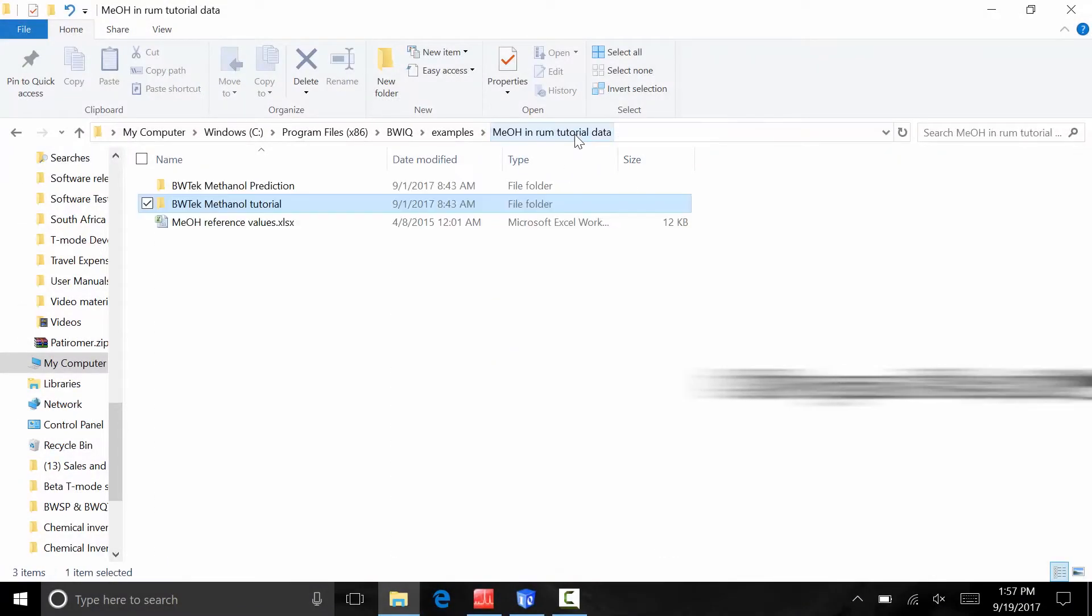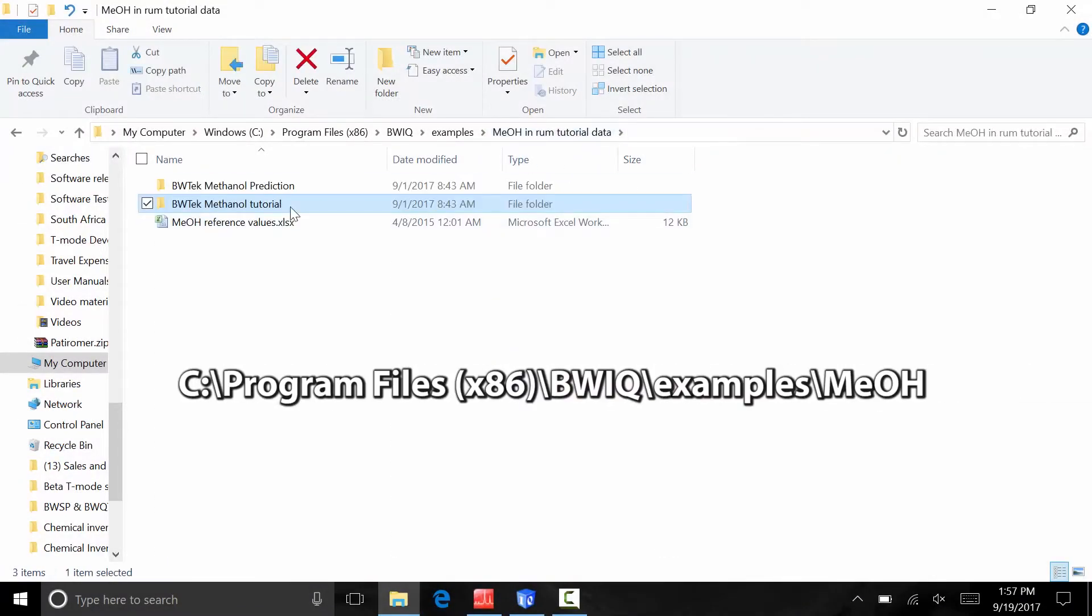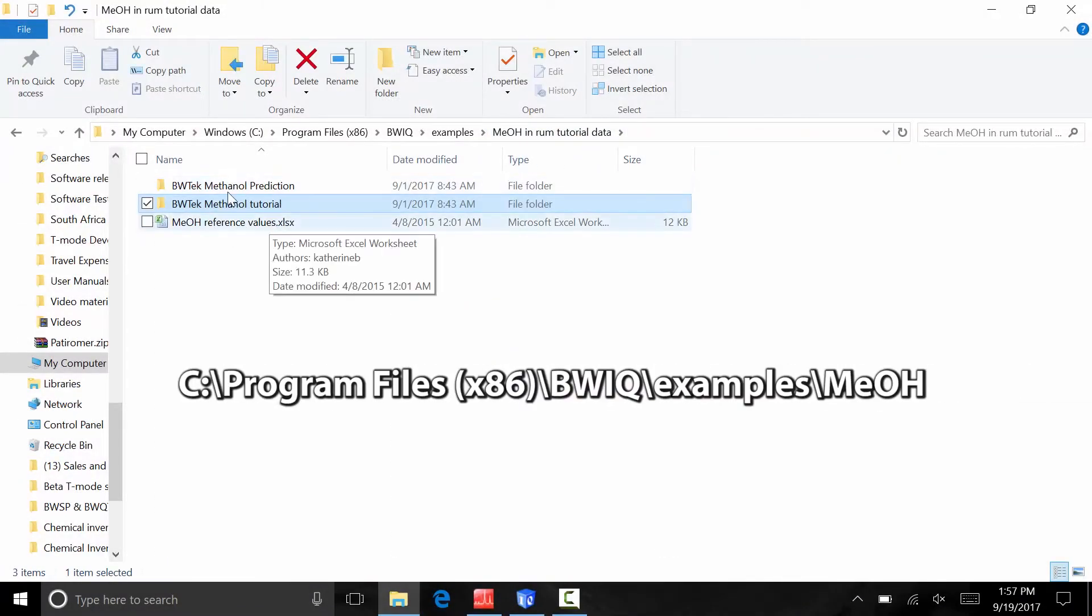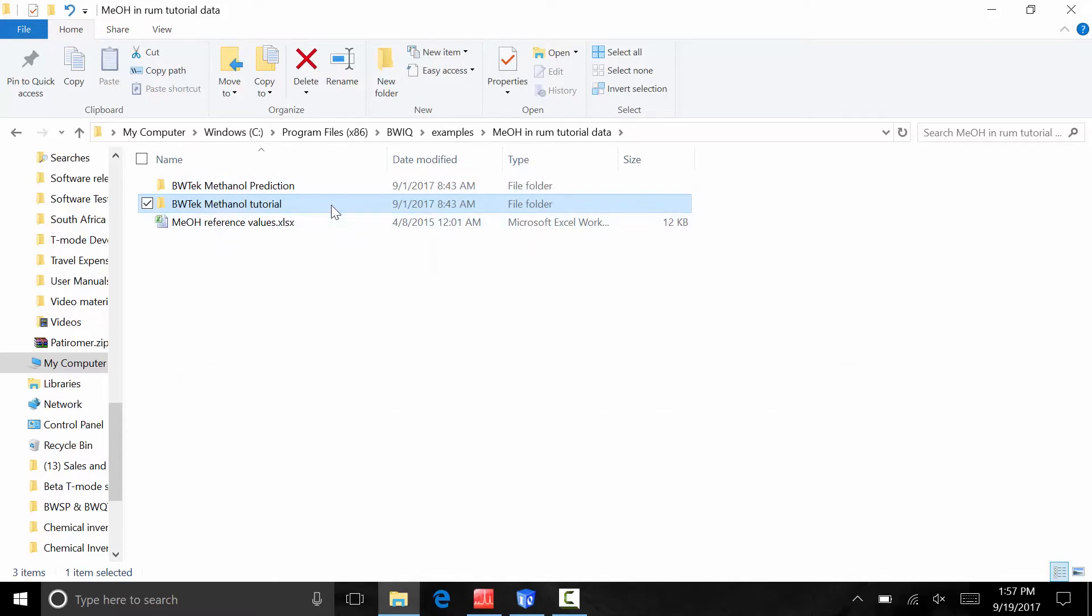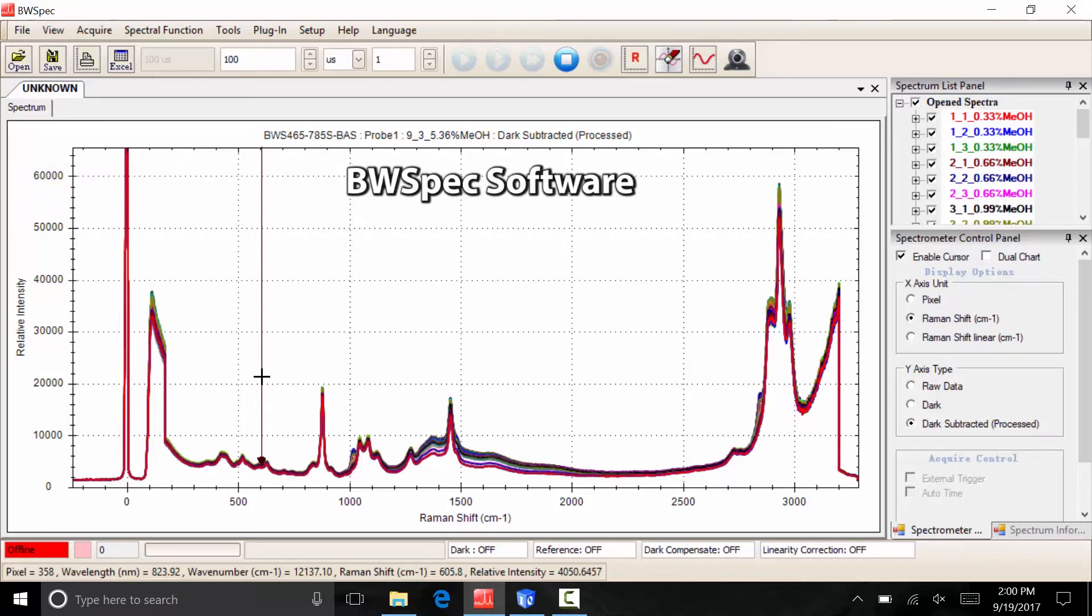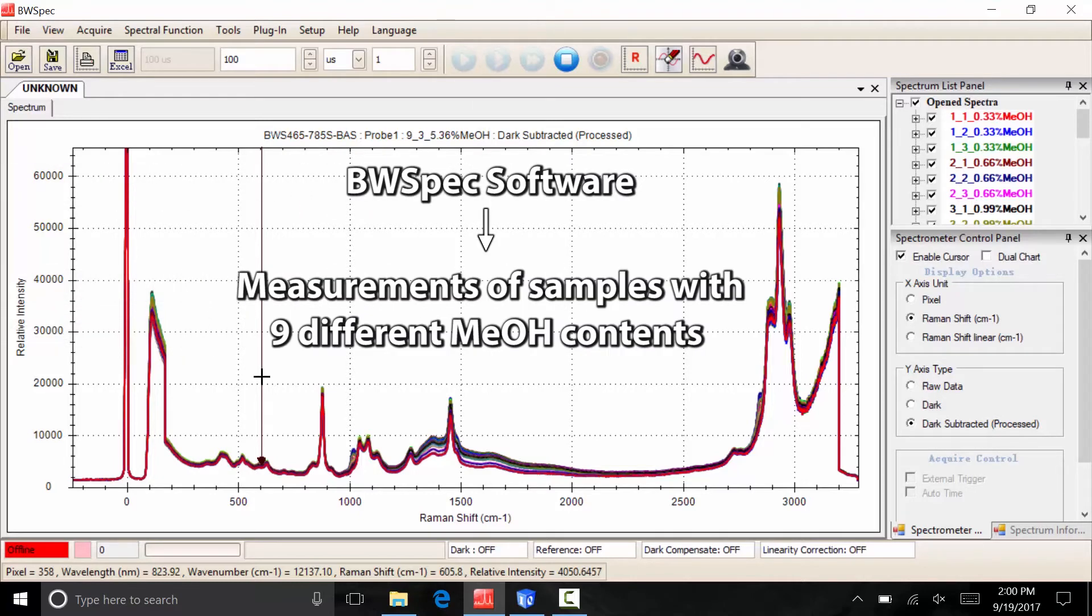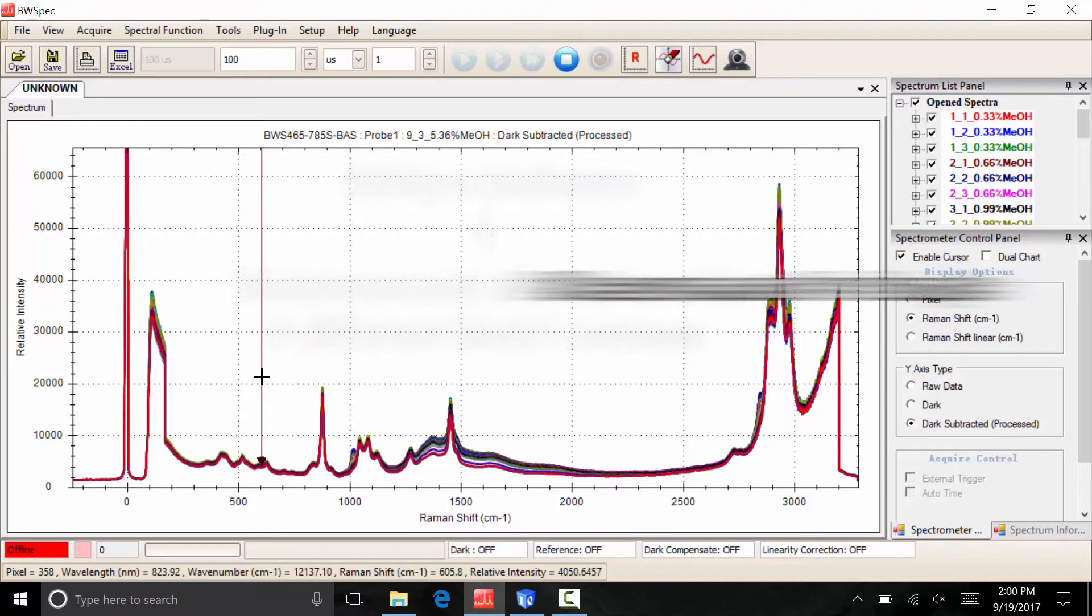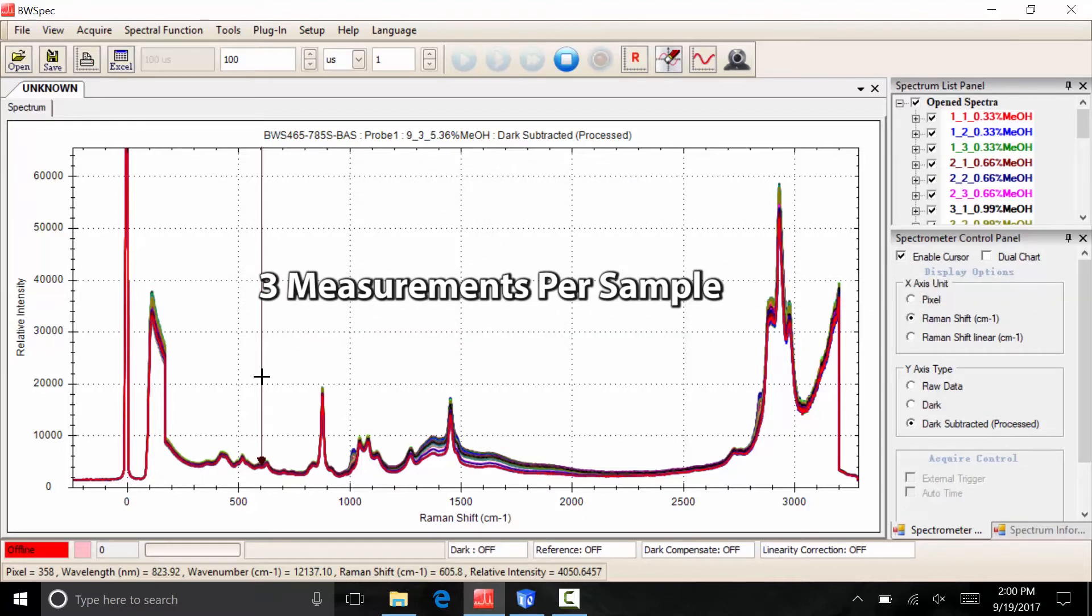Once you have installed the BWIQ software, the data files for this example can be found in this folder. B&W Tech's iRaman Plus Portable Raman Spectrometer with BWSpec acquisition software was used to acquire measurements of samples with nine different methanol contents within the upper and lower ranges. The same acquisition time and laser power were used for all acquisitions. Three measurements per sample were collected.